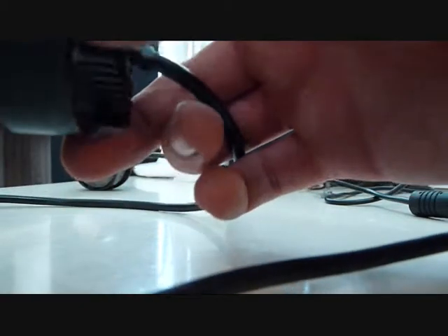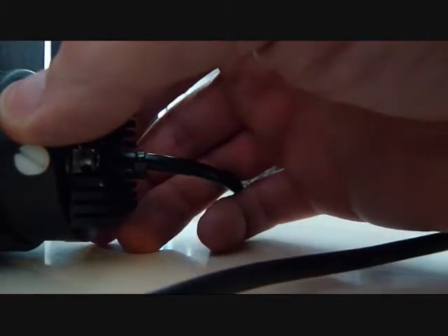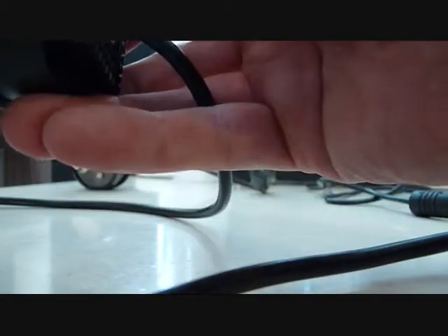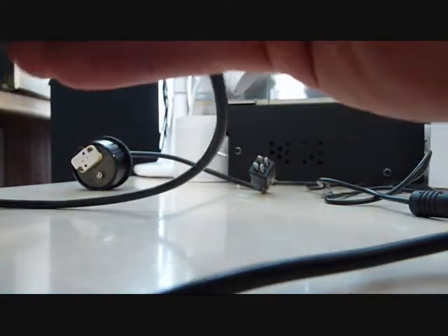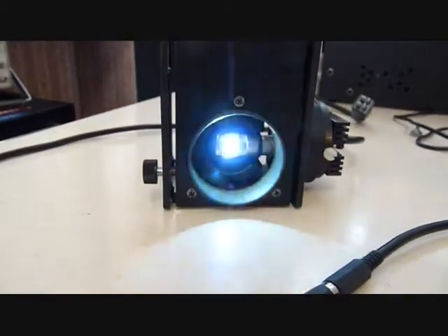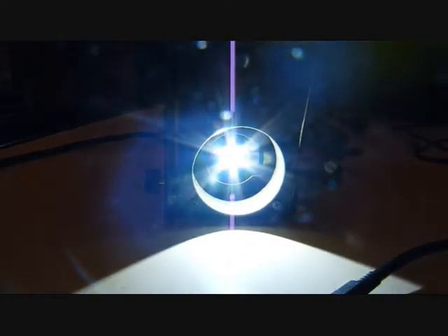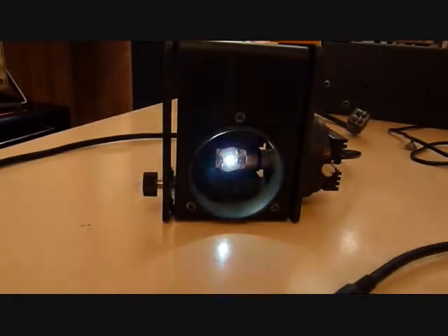I'll just show you how this fits. Really precise fit — it goes into the housing there. You can see it in the housing. And you can see how much brightness there is. There should be plenty of brightness for any application.